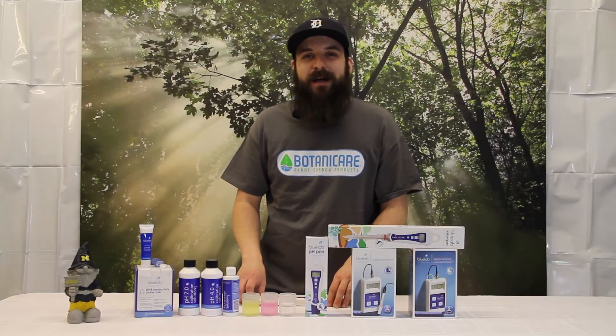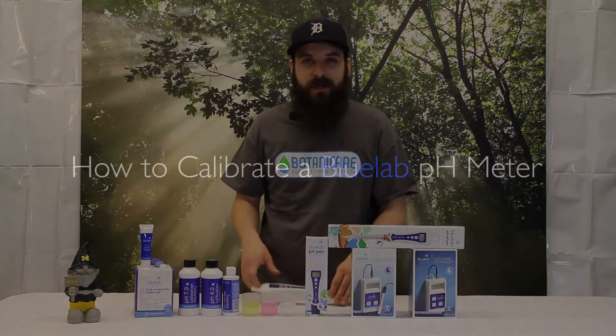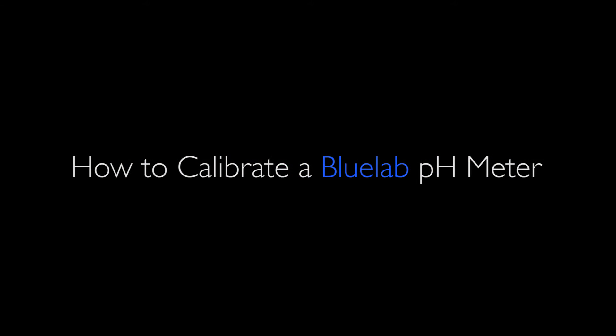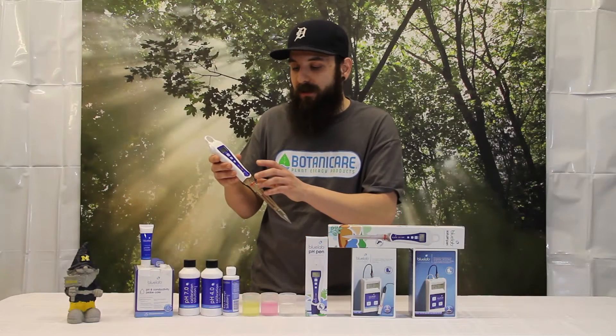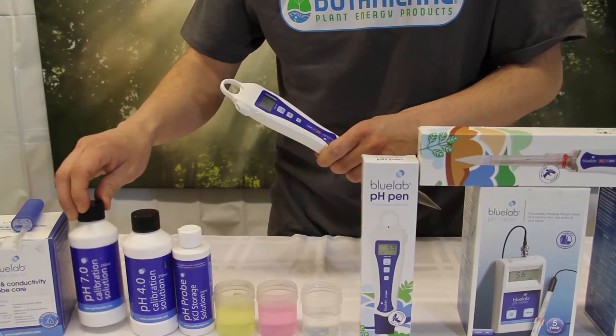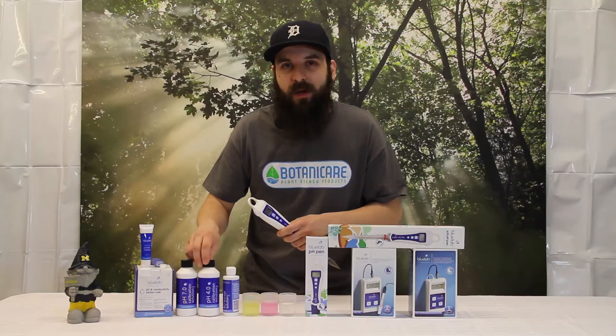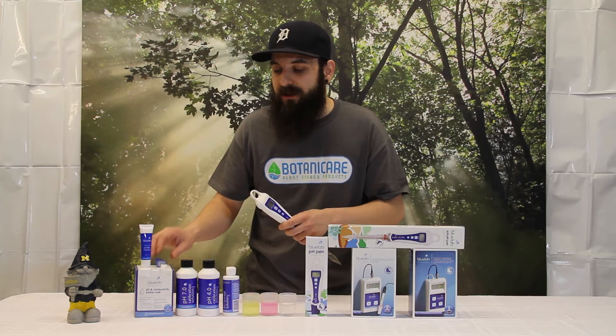Hey guys, this is Matt with 4hydroponics.com and today I'm going to be walking you through how to calibrate a Bluelab pH meter. The one I'm going to be using for this demonstration is the Bluelab soil pH pen. You also need your 7.0 and your 4.0 calibration solution — I do recommend using theirs — and you also have to make sure your probe is clean.